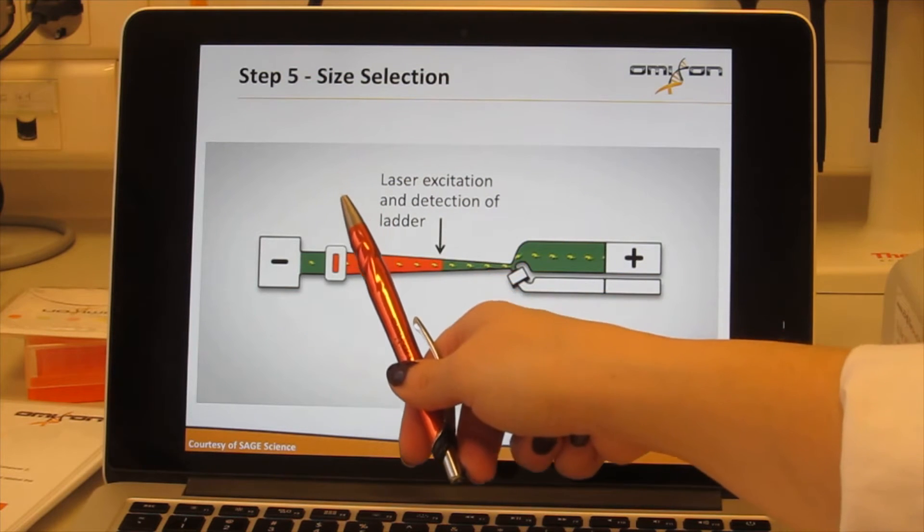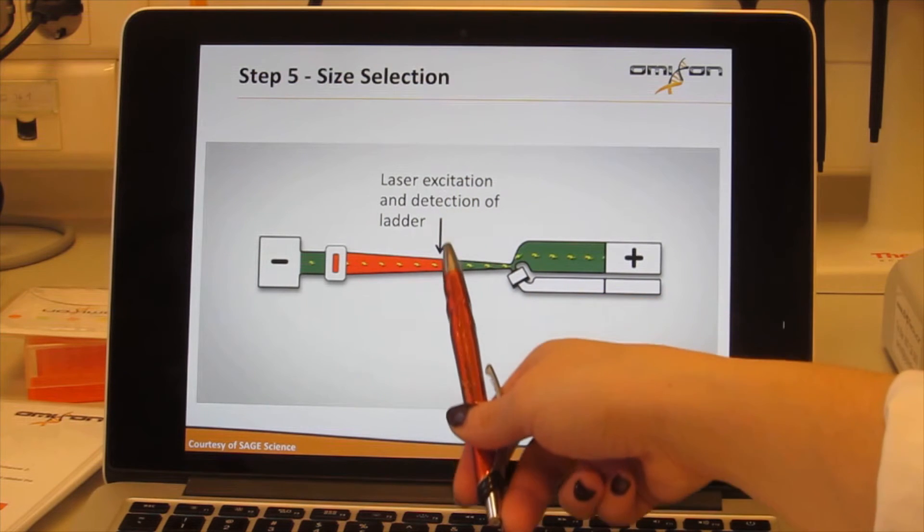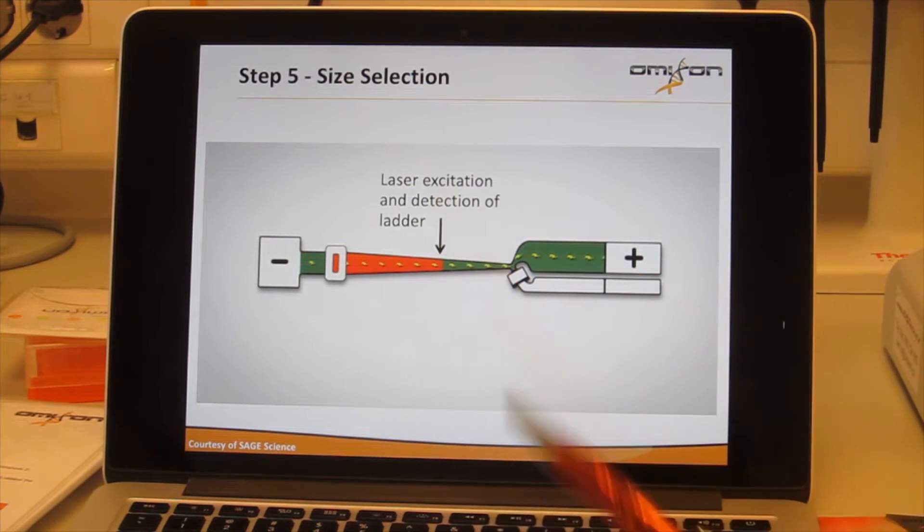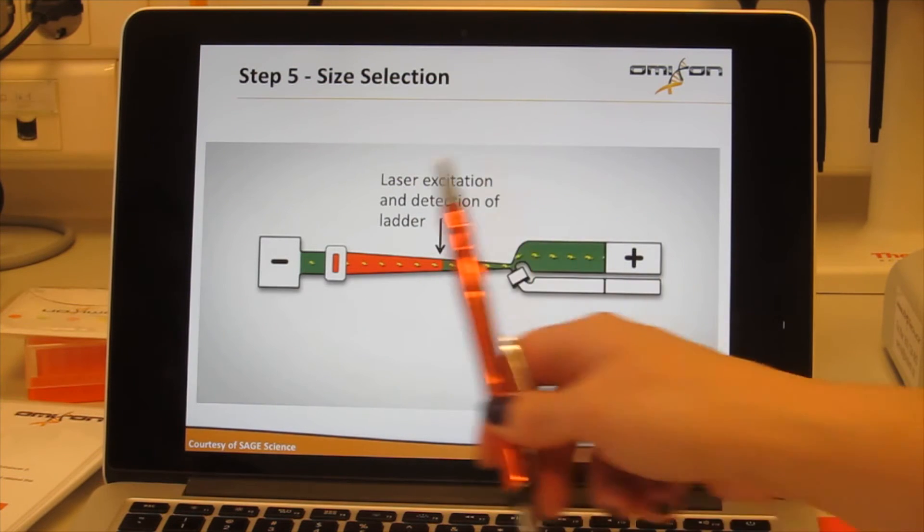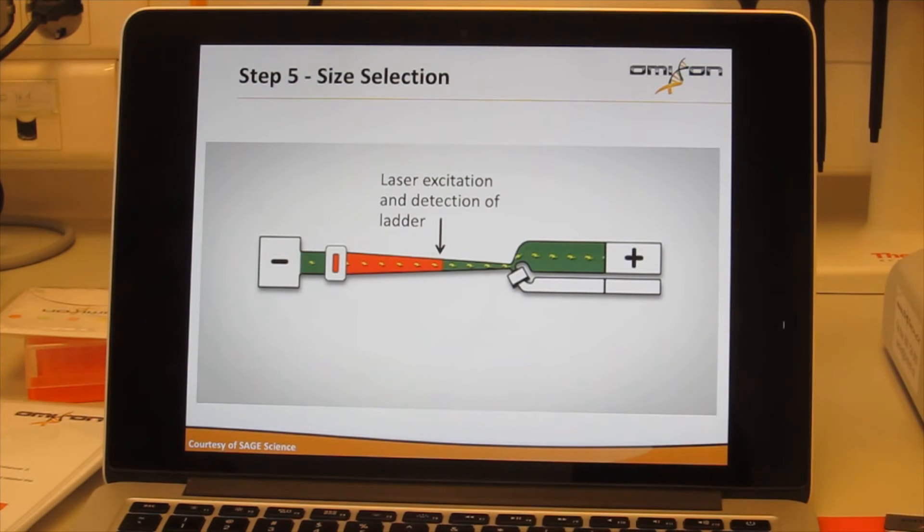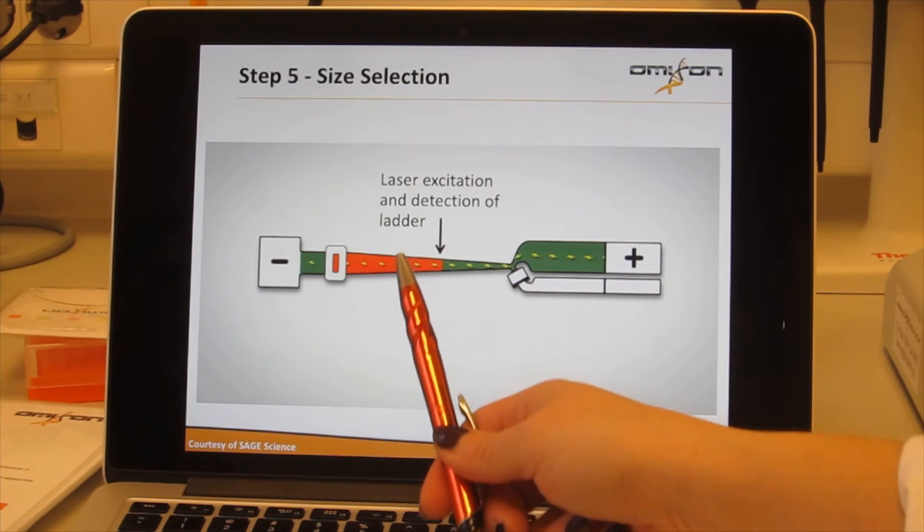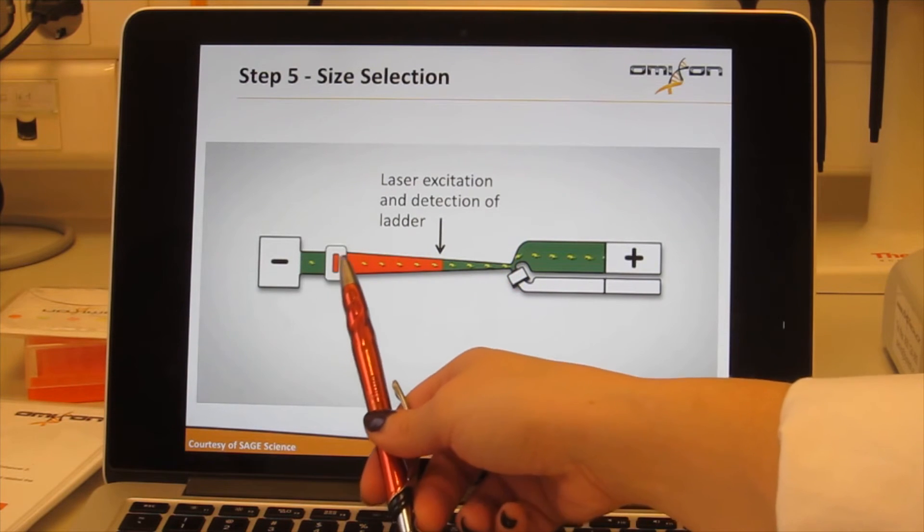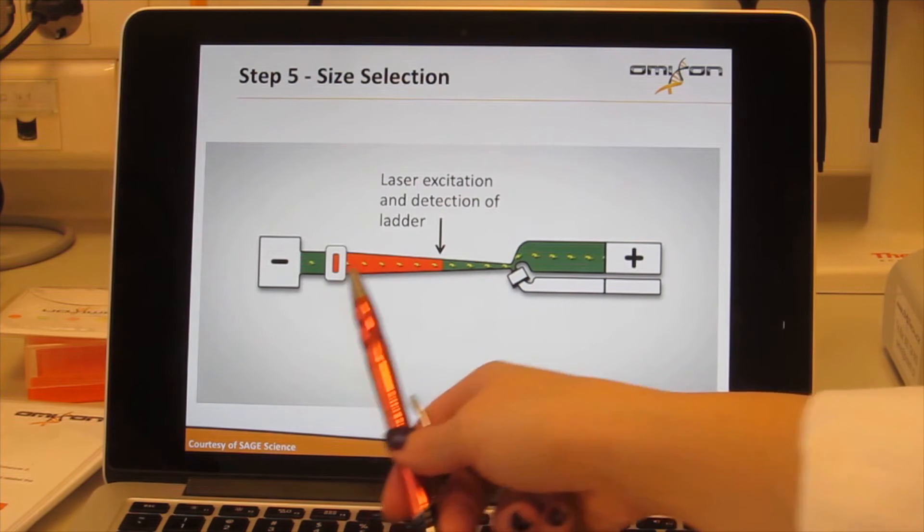As the markers are smaller fragments and they start migrating first, they will be detected by a laser point approximately at this point first. So the 50 base pair fragment will be detected first and then the machine will calculate how much time it took for the 50 base pair fragment to go from this point to this point. Then the 150 base pair marker will be detected second and the machine will do a similar calculation.